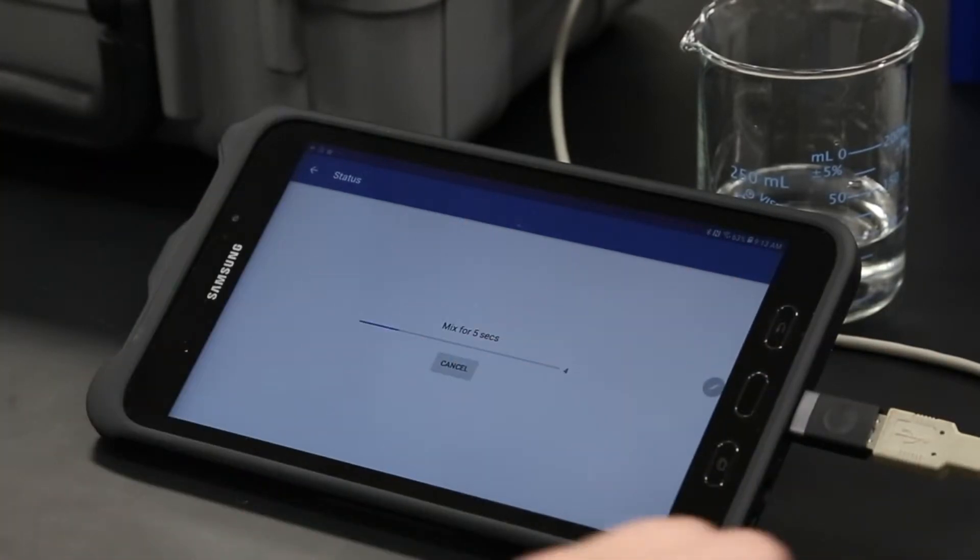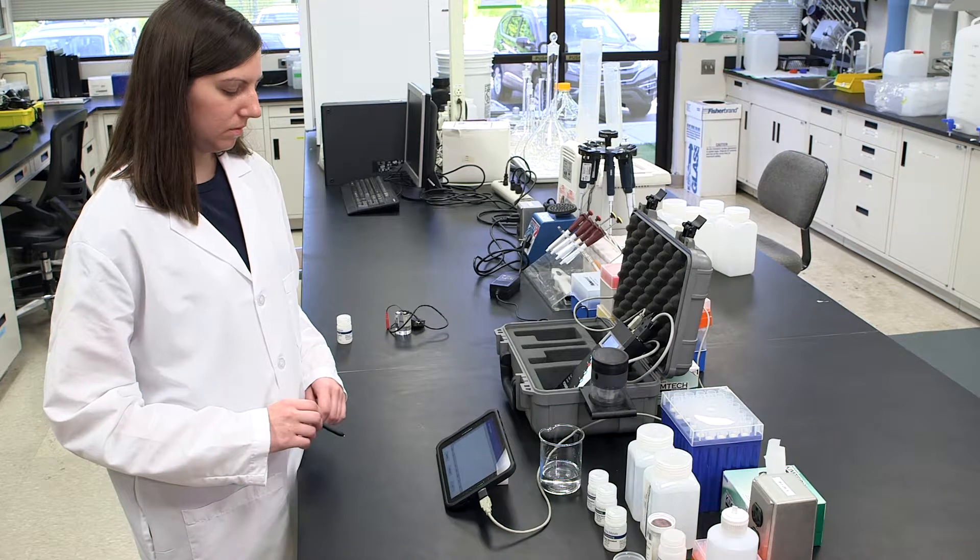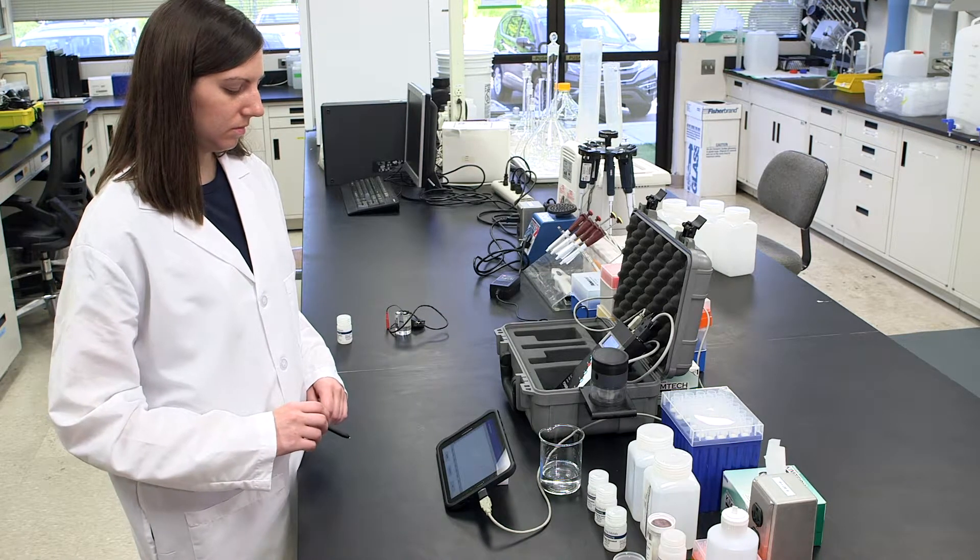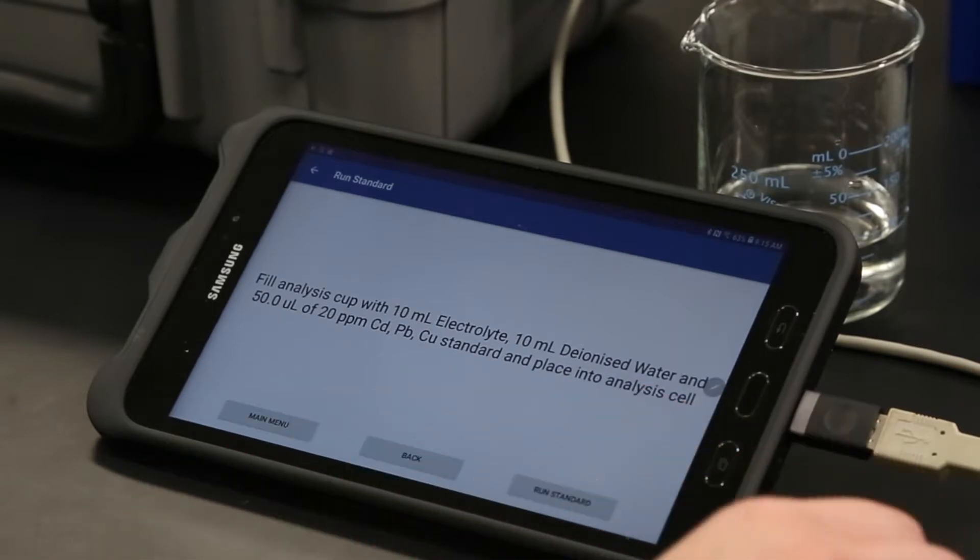Place the electrodes into the cup and click Next to initiate the measurement of the blank solution. Alternatively, if a blank is not required, the Skip Blank button may be selected. This video will carry out a blank. Upon completion, the voltammogram for the blank solution will be displayed. Once a good blank is achieved, click Next to analyze the standard.